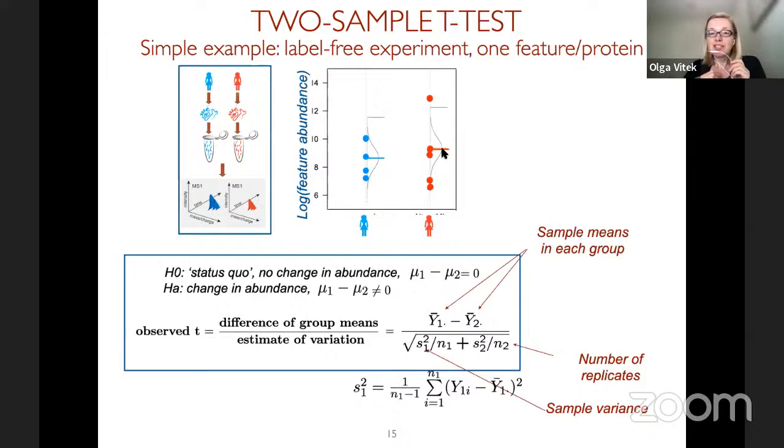Now, if the protein is changing on average, it doesn't mean that it has good predictive power for one person. But in terms of screening many proteins for their relevance to a disease, or in terms of just doing basic science and understanding what is affected by the stress, this is totally appropriate. And so that's what we would want to do.